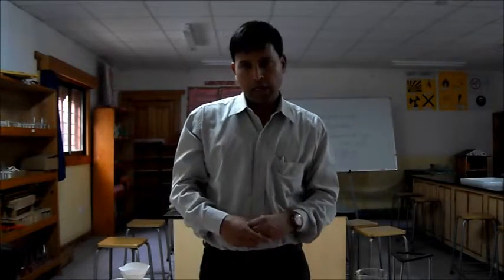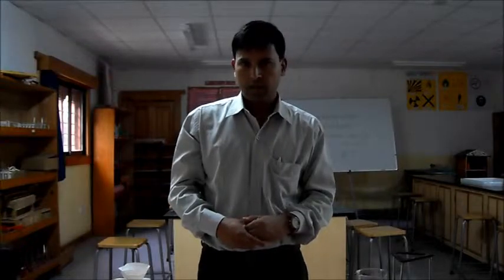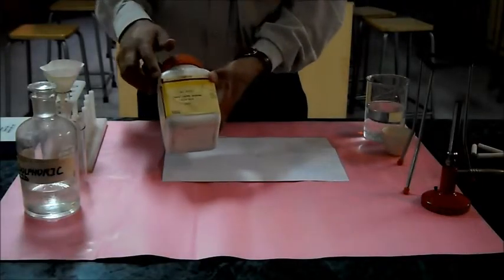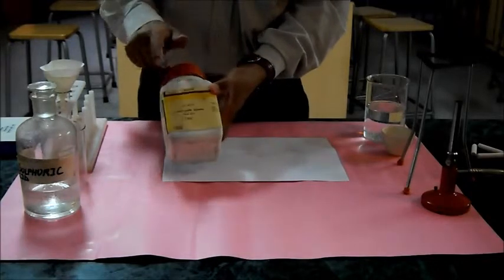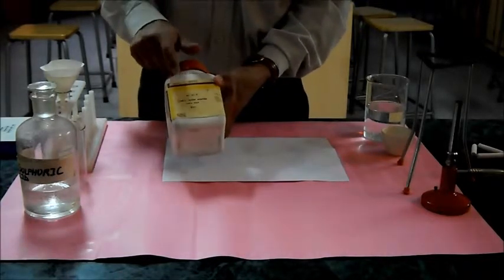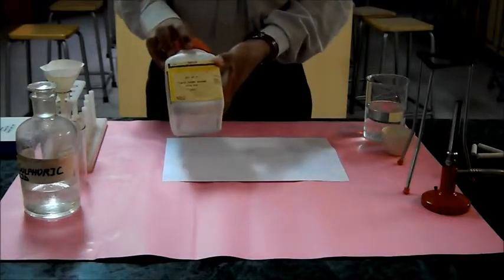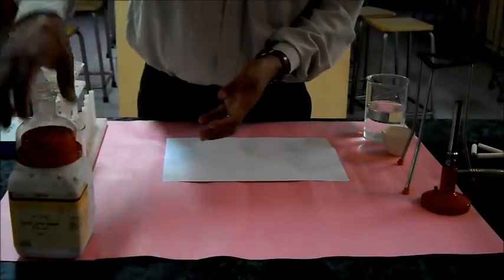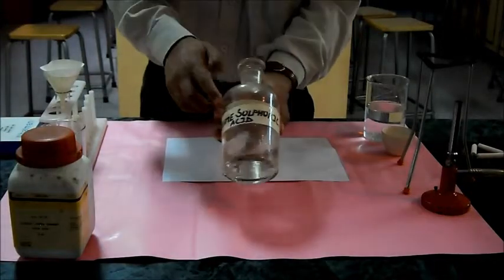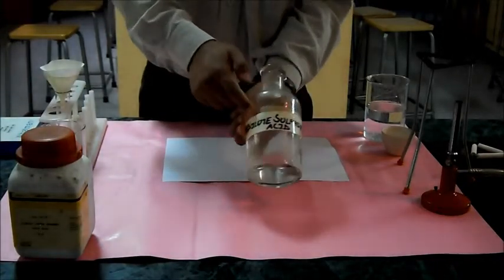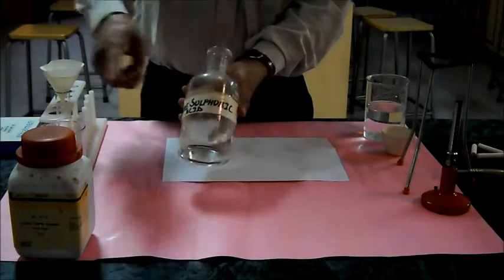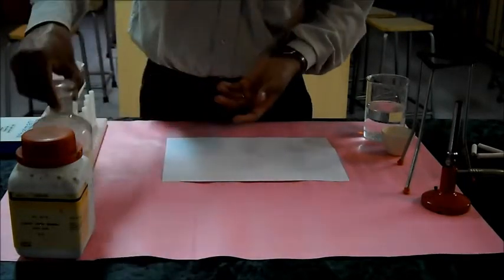We will be using acid and base. This is copper oxide which is a base but not alkaline, so this base is not soluble in water, but we will make it react with acid. For that I have got dilute sulfuric acid. This sulfuric acid would neutralize the base as copper oxide.